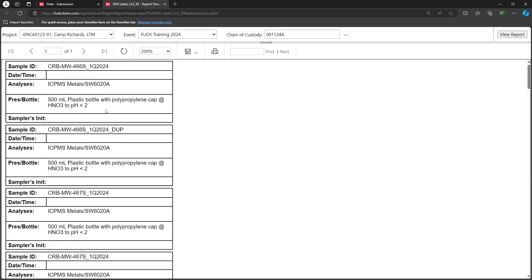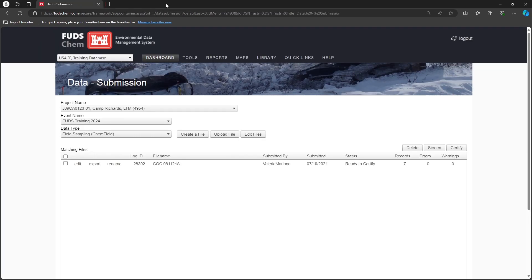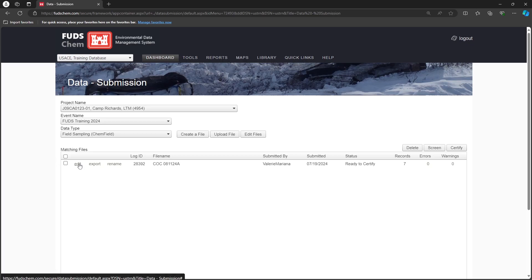Let's move forward in time to when our field team returns with the final information we need. We will finish filling out our chem field file. Under Tools, Data Submission, click Edit next to the file name.